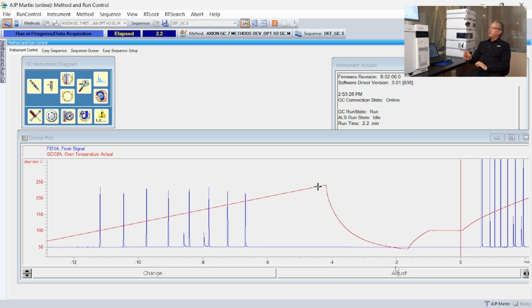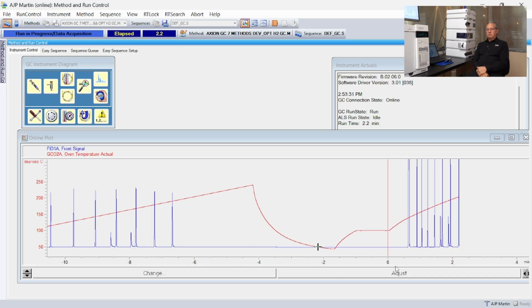And this is an example. I need to remind myself to chat with Ruth. Like, I would not want to run the sample in the class because those alcohols are way too small. They should be bigger. I mean, the fact they're tailing is part of it, but the area counts are low, which I think came from a dilution from the thing that was in the freezer. The alcohols were precipitated out. Someone diluted it and didn't get the alcohols. Why do you want them bigger though? 'Cause sometimes in real life you run into this situation where some peaks are bigger than others. Yeah, actually, you're right.